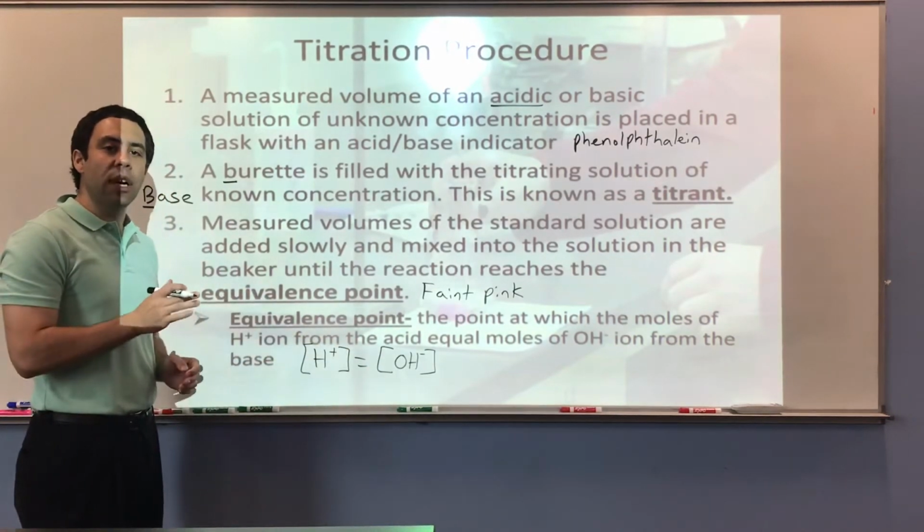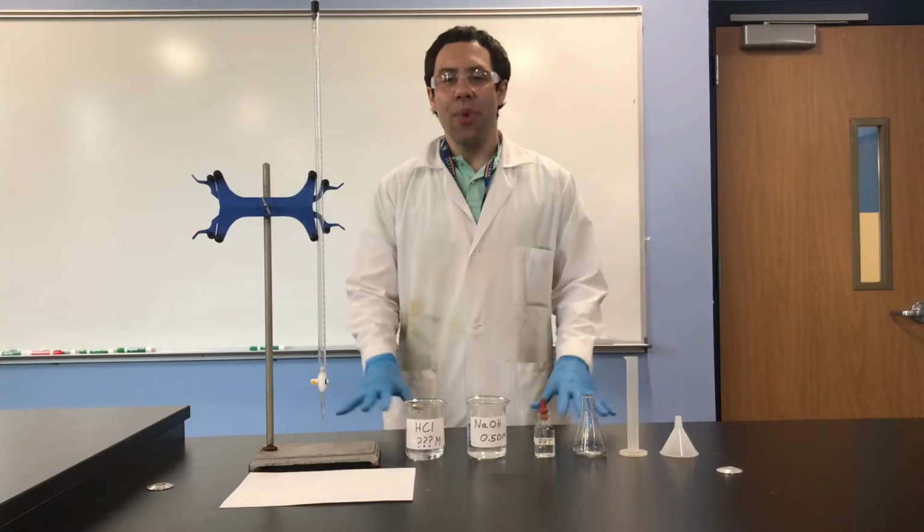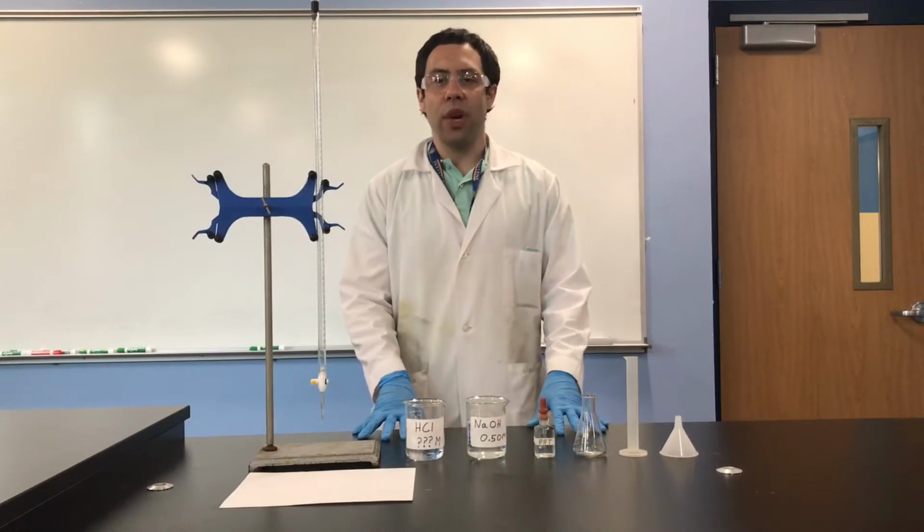It is neither acidic nor is it basic. Let's do a titration together. Here we have a setup for an acid-base titration.